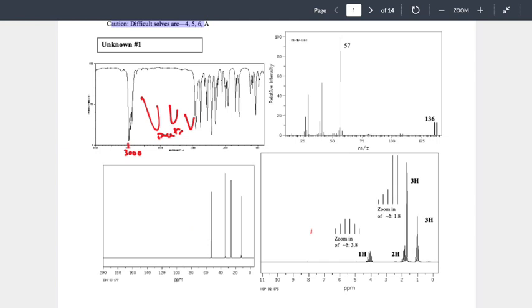The other thing we could look for is exactly where you referenced to begin with. You said you saw something at 3,000. Do any of our other things have any numbers at 3,000? No, so we can use the information of our axes to help us narrow that down. So we've got a signal at 3,000. I would actually argue we don't have a signal at 3,000, but highlighting that 3,000 range becomes really important. Because if you're slightly less than 3,000, that means one thing. If you're slightly more than 3,000, that means another. But that's really hard to see on this particular graph, right?